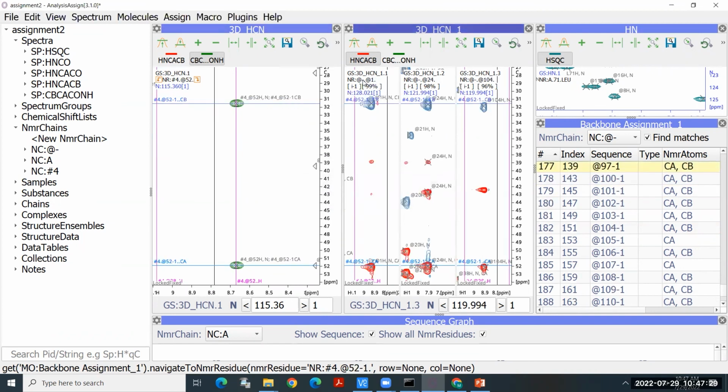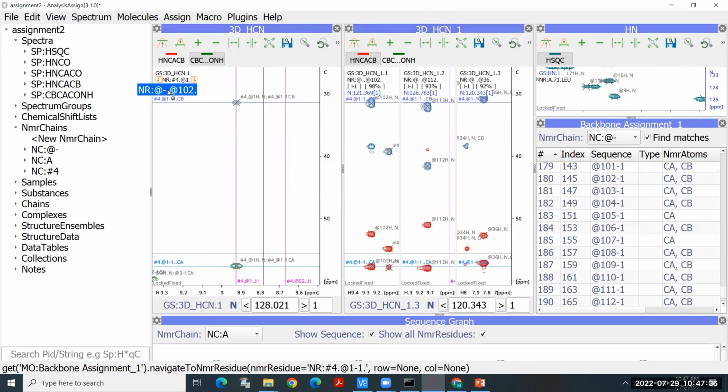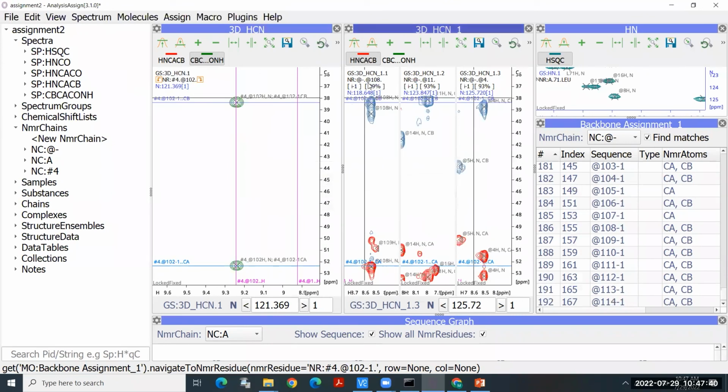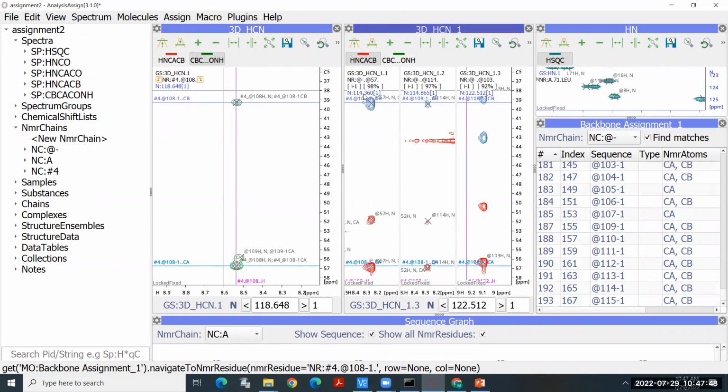And number 1 and 102. And next is 108. All right, so I think next is 57.